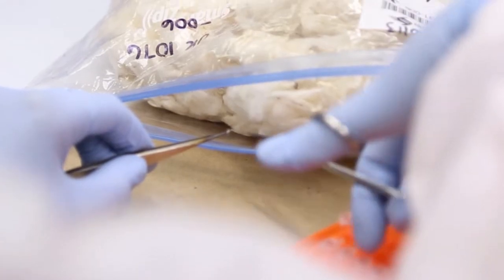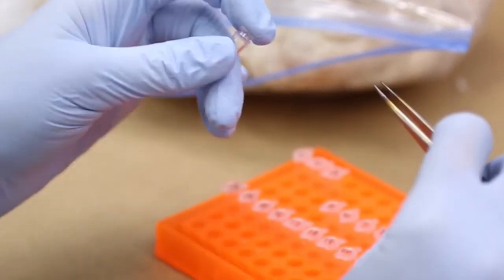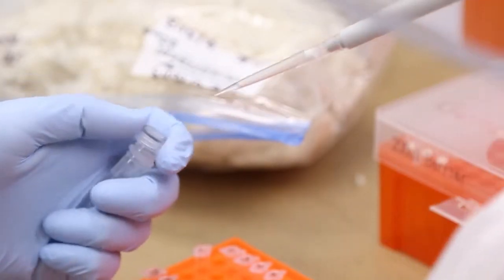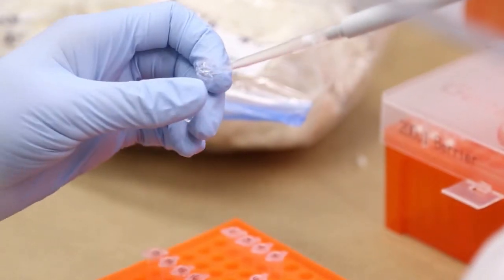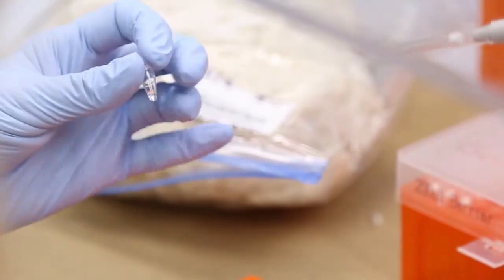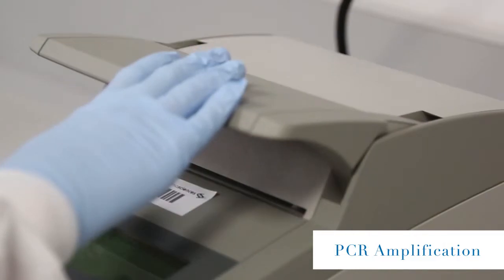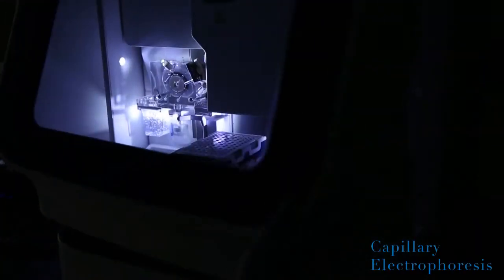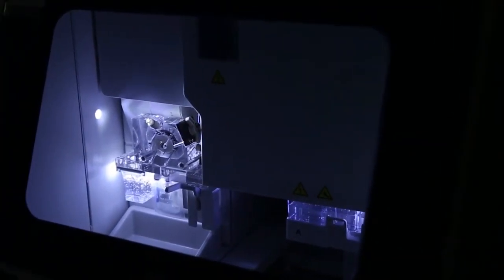Like a paternity test, a small sample is analyzed at Applied DNA Sciences Laboratories. Our scientists take a small sample, clean it and purify it, and prepare it for fiber typing. The prepared sample is then fiber typed using a method called PCR amplification. Used by forensic labs worldwide, PCR is a technique used to amplify specific regions of cotton DNA.